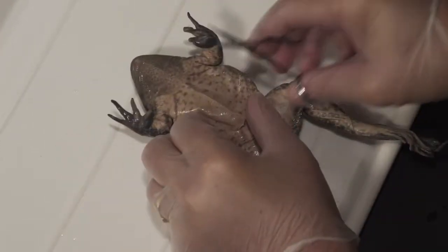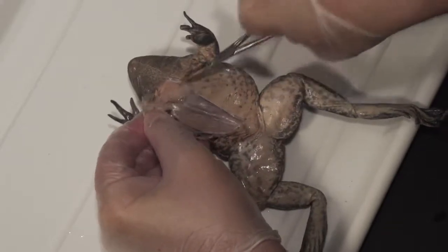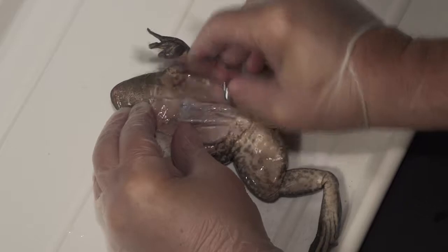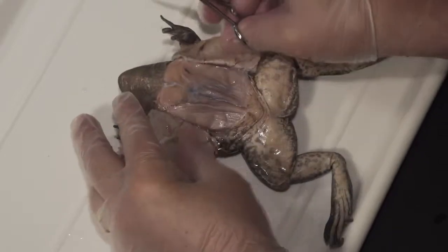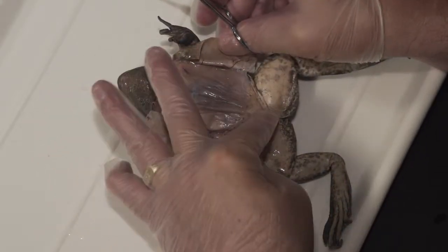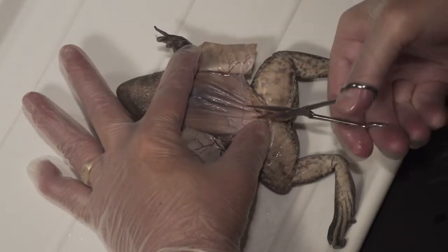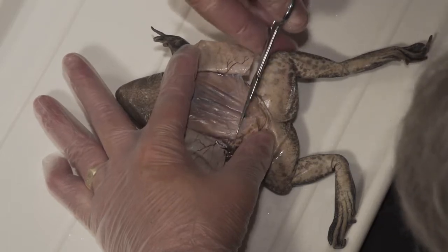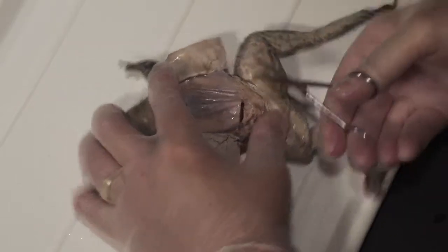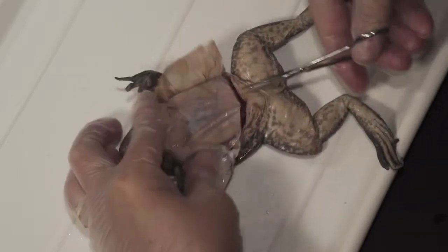Now you basically have some flaps you can peel back. There's a little connective tissue there — peel that back. And now you've exposed the muscle, the abdominal muscles. Your next step would be to do basically that same thing: cut through that, keeping your scissors pressed up against the muscle, cut sideways and then up the midline.